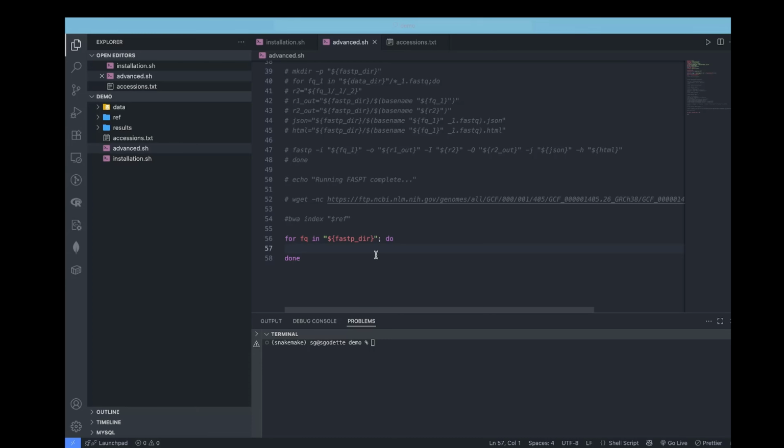The first thing we want to do is to iterate over only the read1 files. That is why we want to tell the program to only iterate over files that end with the _1.fastq. And now from these files, we can now create our read2 files, just as we have been doing. To create the read2 files, it's pretty much simple. We just need to type in R2 and then access the read1 fq like that, and just replace the _1 with an _2.